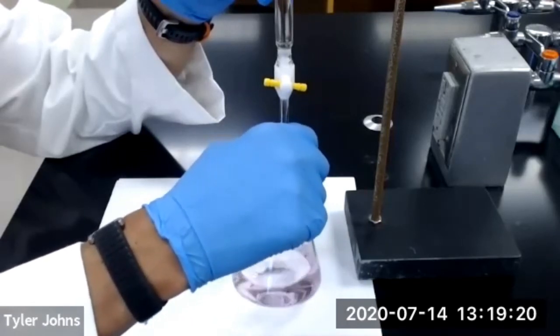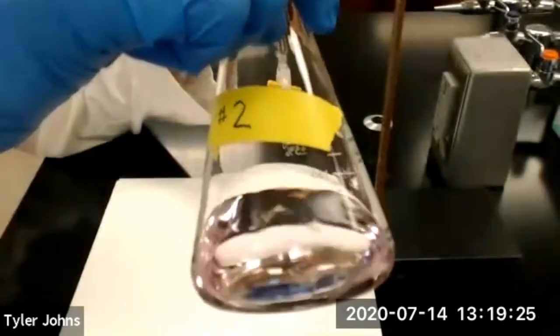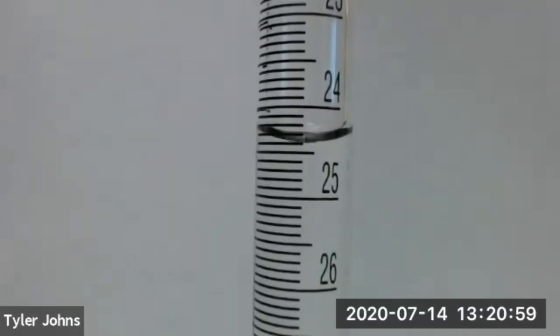We now have a persistent faint pink color, so we have reached the endpoint of trial number two. This is the final burette reading for trial number two.